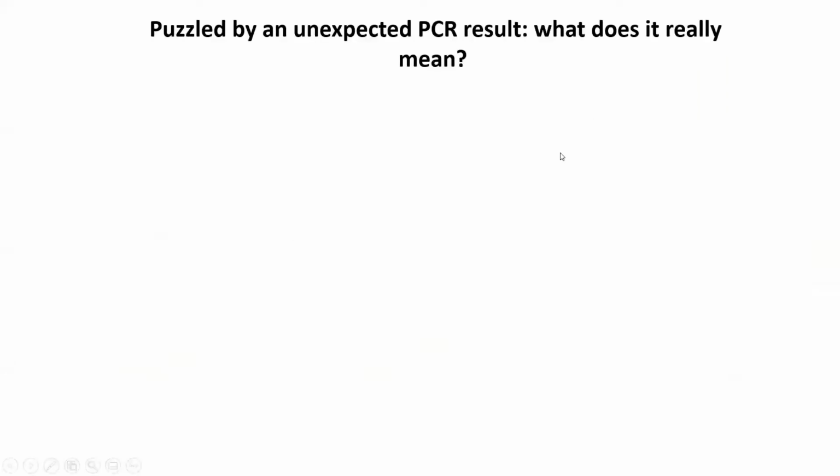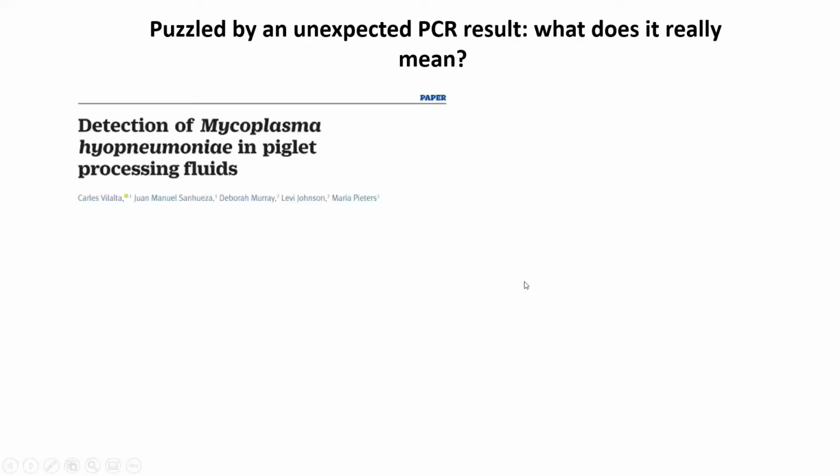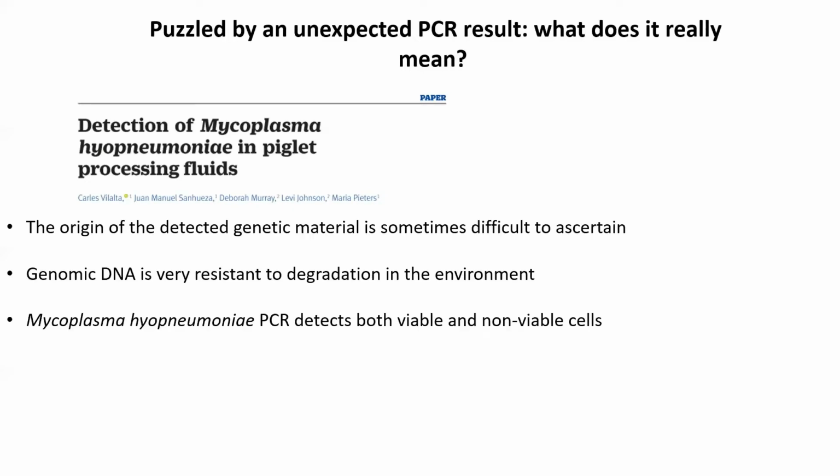And again, PCR is a greatly used diagnostic tool because it has high sensitivity and specificity, but sometimes we can be puzzled by an unexpected PCR result that we don't know how to interpret. And I can really tell what it's like to be puzzled by a PCR, as we recently had problems of interpretation with the detection of Mycoplasma hyopneumoniae in processing fluids, in which we detected the bacterium in a sample type that is not coming from the respiratory tract. And after extensive investigation, our hypothesis is that it could be environmental contamination of the samples rather than true presence of viable mycoplasma.